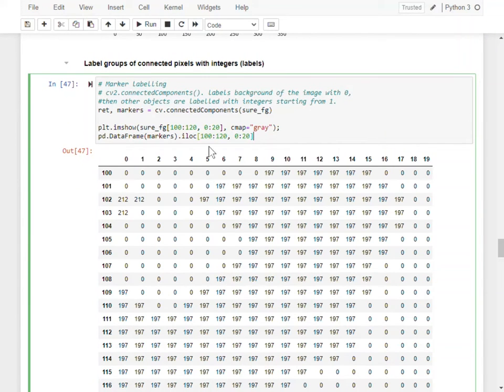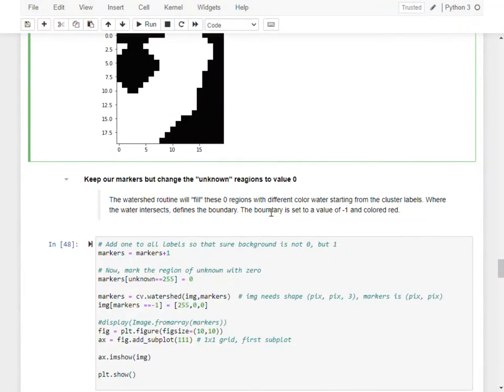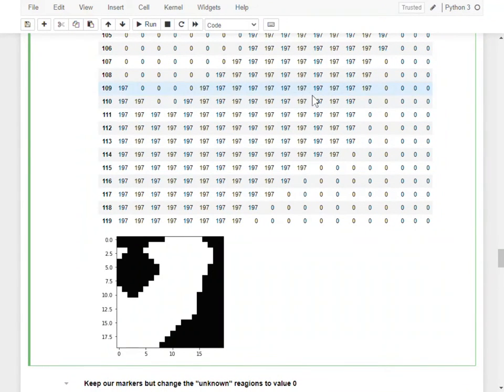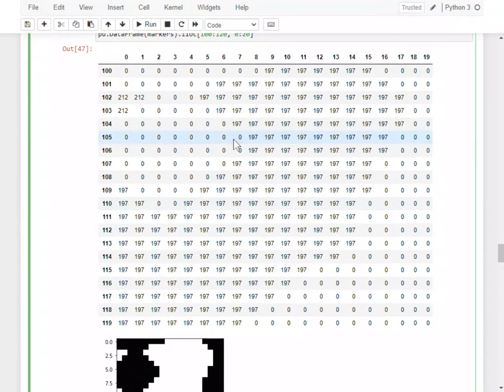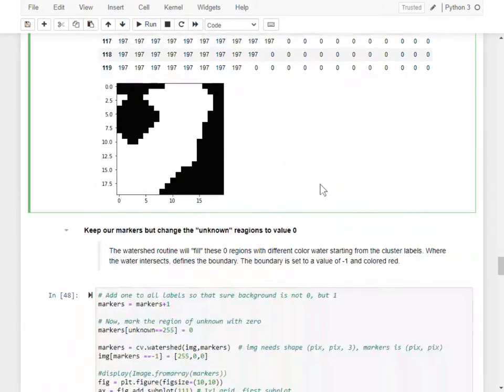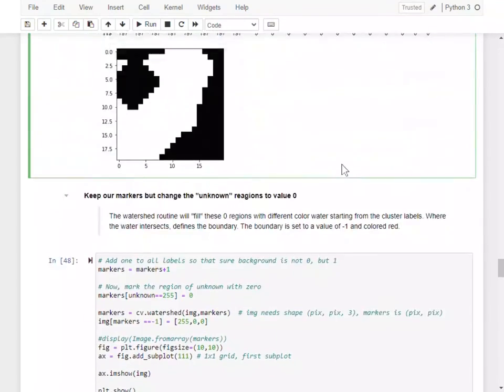All right, and this is just plotting it and showing it here below. Let's see. Okay, so we have that. We've got all of our grains numbered. Okay, again, what we don't have yet is these black regions. We haven't started to fill these in yet and figure out where the real interface is. So that's what we want to do next.